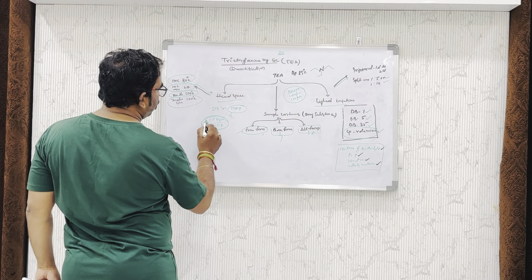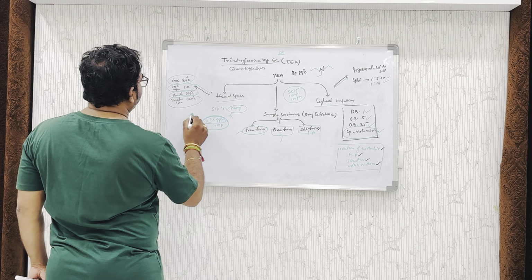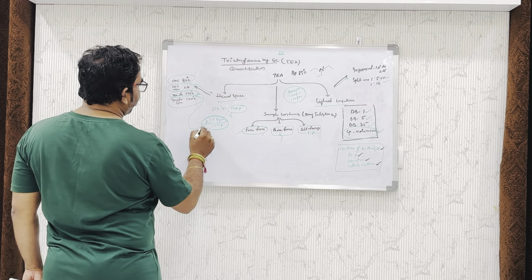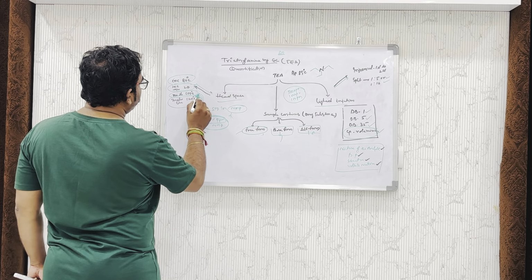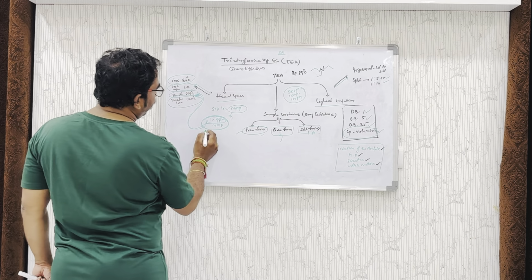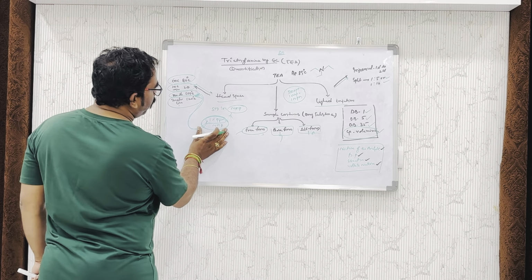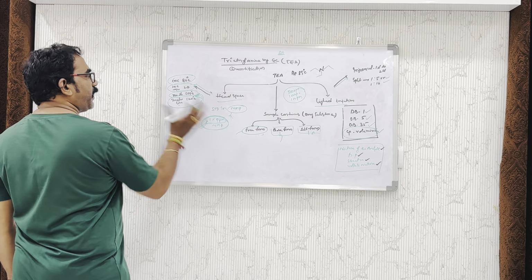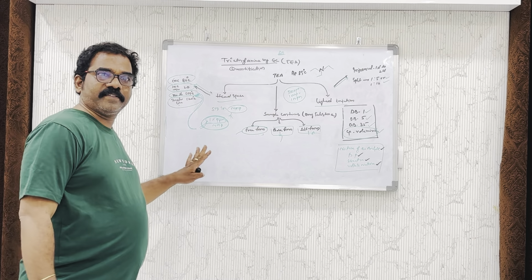This piperazine, first of all, will bind with the transfer line. It minimizes the carryover of triethylamine from injection to injection. It means the piperazine binds to the transfer line, then triethylamine will not carry over from injection to injection. This is the most important thing when we are adding piperazine in the quantification of triethylamine. This is the simple technique. Thank you, friends.